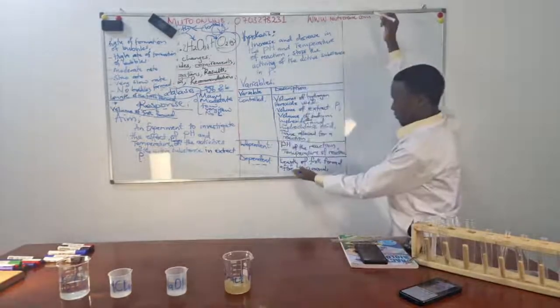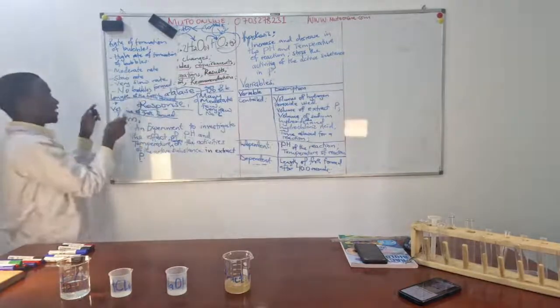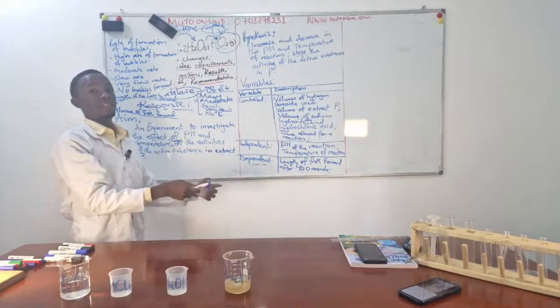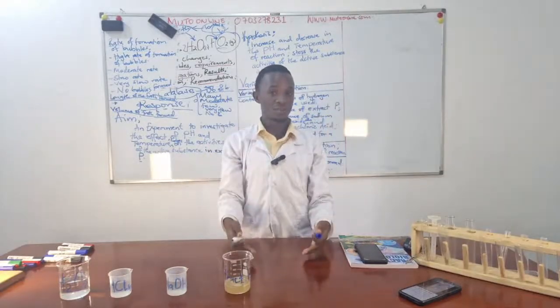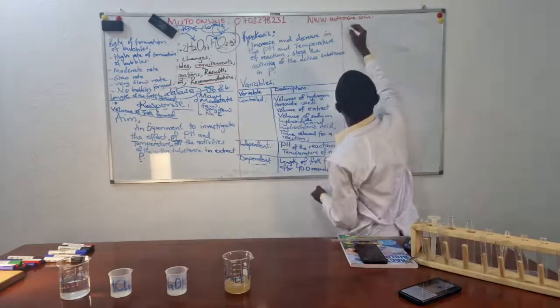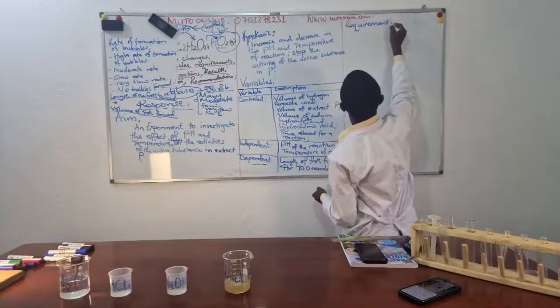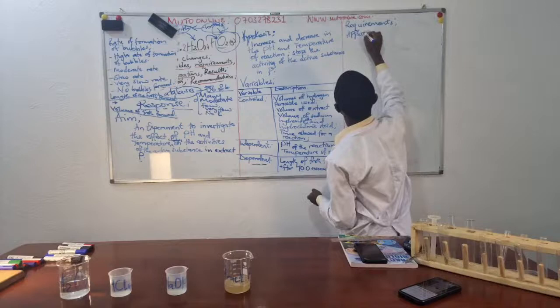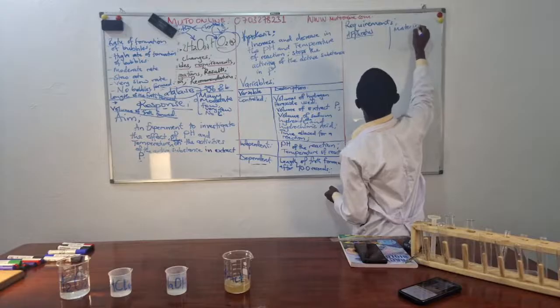So to continue, I'm going to take the dependent variables that I've given you, the expected dependent variables and their expected observations. When you use this, what should come to your mind as your observation? To continue, we are to give requirements, and I will always separate apparatus from the materials.